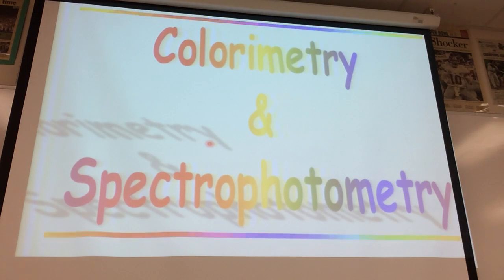All right, so we are going to talk about colorimetry and spectrophotometry, and this is one topic that's not covered in a typical college chem course, but it's specialized for AP Chem. We're going to focus on the highlights.